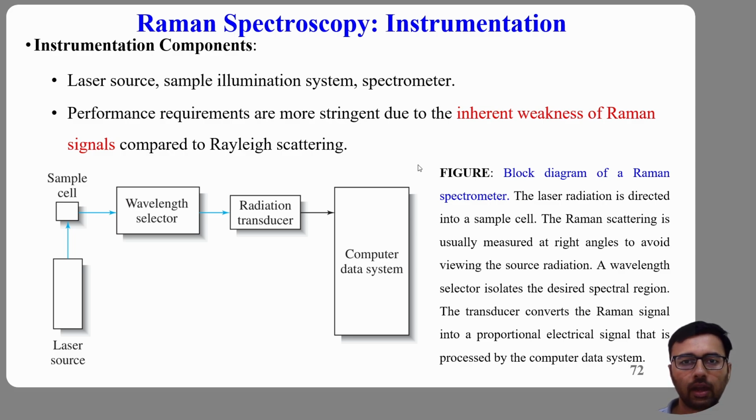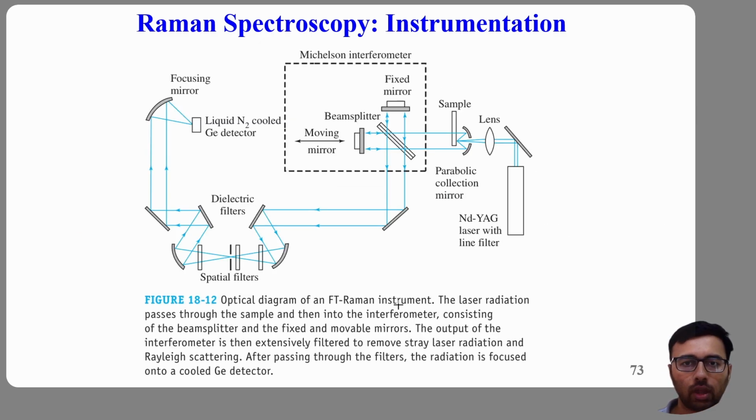Remember, Raman scattering is extremely weak. If you used an ordinary lamp, the scattered signal would be buried in noise. The invention of the laser in the 1960s transformed Raman spectroscopy from a laboratory curiosity into a practical analytical technique. Now let us look at the modern Raman spectrometer.